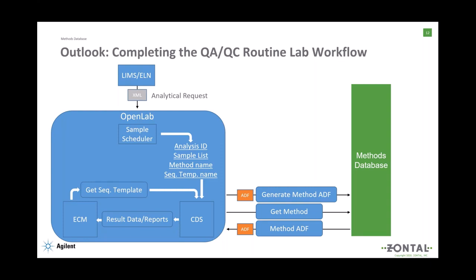And this information is typically sent automatically to the CDS if, let's say, it is allowed to transmit it in an automated way. In Sample Scheduler, we have different modes of action, different states, we call this. We have the automated, but also the waiting state as well. This means if you have, for example, vials to operate or a tray to bring to an instrument, you cannot have a fully automated chute from Sample Scheduler to CDS. You have to wait until the tray is loaded.